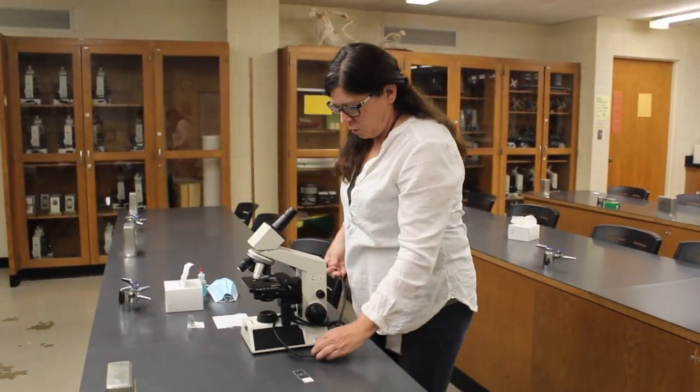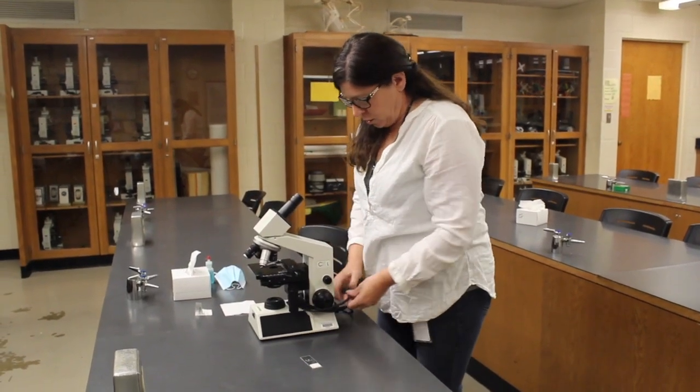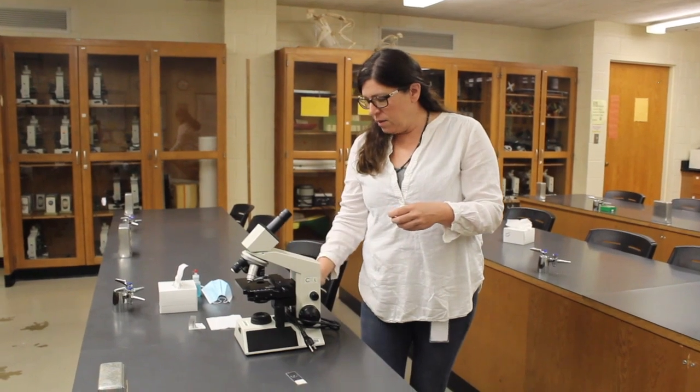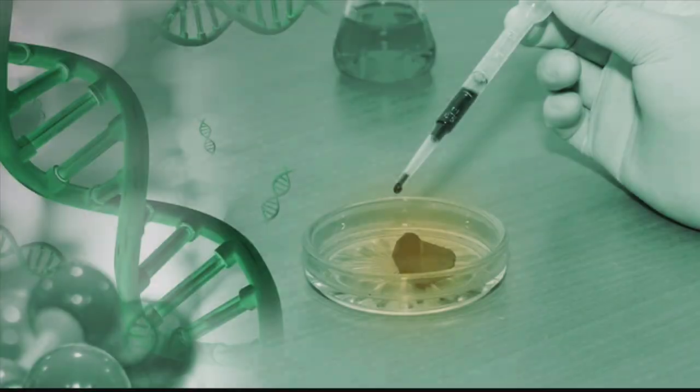And once the cord is wrapped around the base, you're going to do one last cleaning. So that alcohol prep wipe that you had, you're going to clean your hands just very gently. And the thing that you touched was the coarse adjust. So go ahead and wipe those down again.